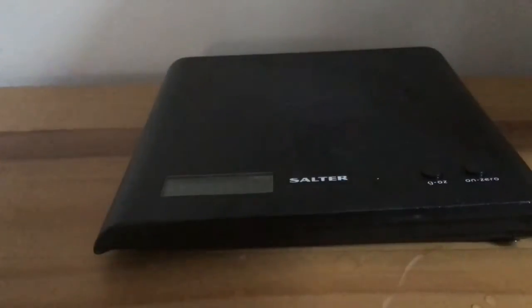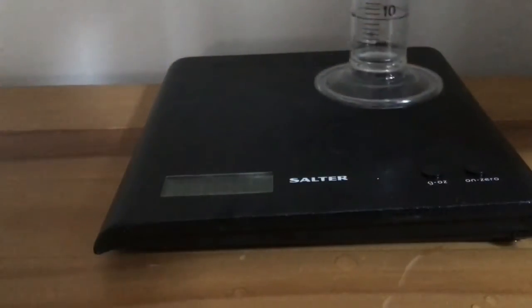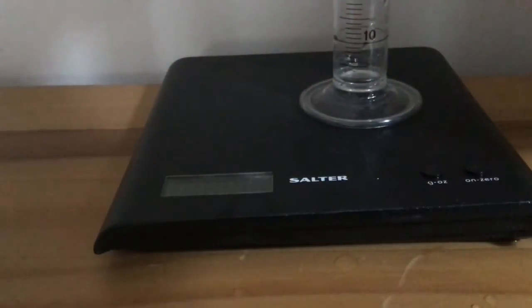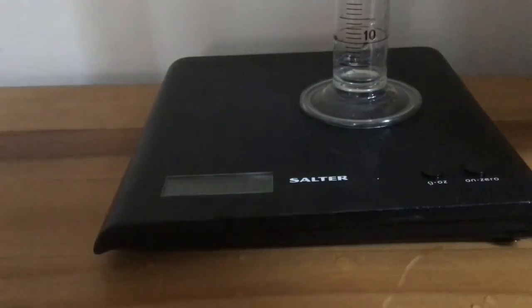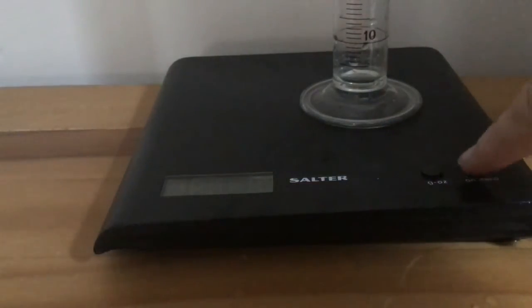So here's another experiment to find the density of water. We put a measuring cylinder on an electric balance and re-zero the balance.